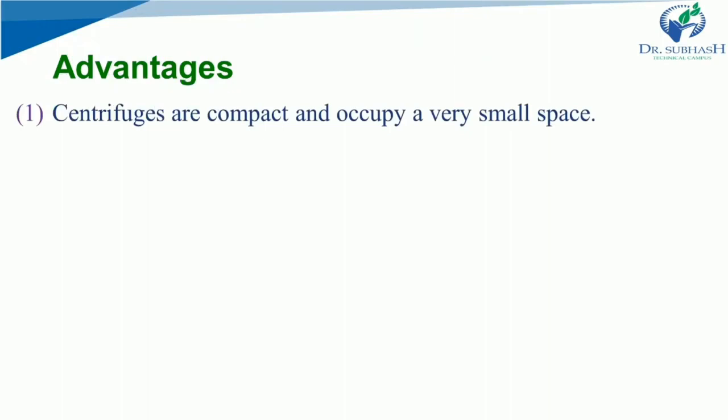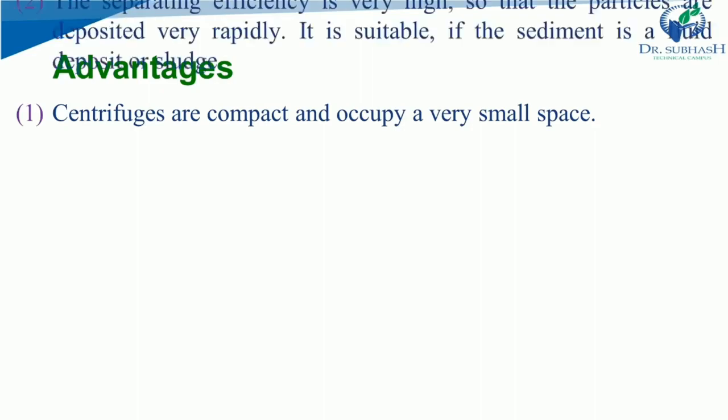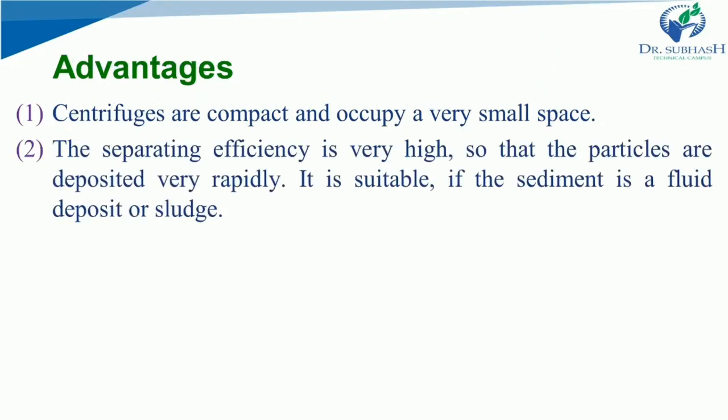Advantages of centrifuges that work on the sedimentation principle: they are compact and occupy very little space. Centrifuges that depend solely on sedimentation have a really small size, so you can fit them in your lab too. The separating efficiency is really high, so the particles are deposited very rapidly.